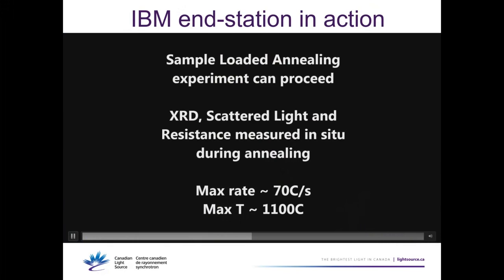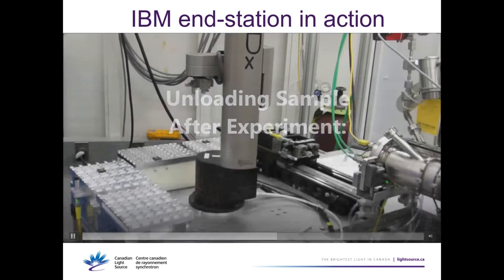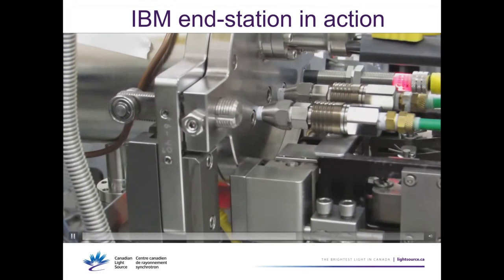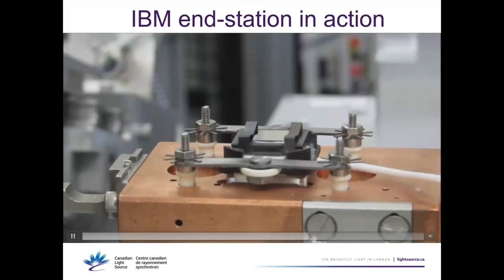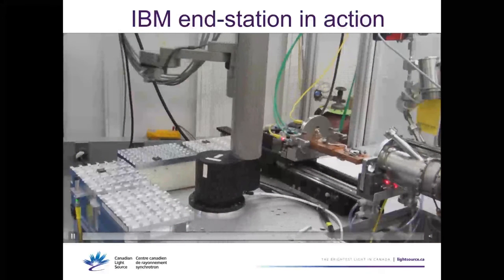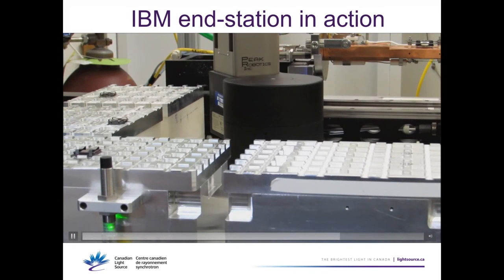Now we proceed to pump and put the selected gas atmosphere, do our thermal annealings, our X-ray diffraction measurements. After this, I'm going to show examples of research that are done in this station. Very compact. It goes through the same process in reverse. Lock here and take the sample out. So we receive shipments of samples that we load, and the experiments can be run by programming long sequences of thermal annealing for many samples for several days.